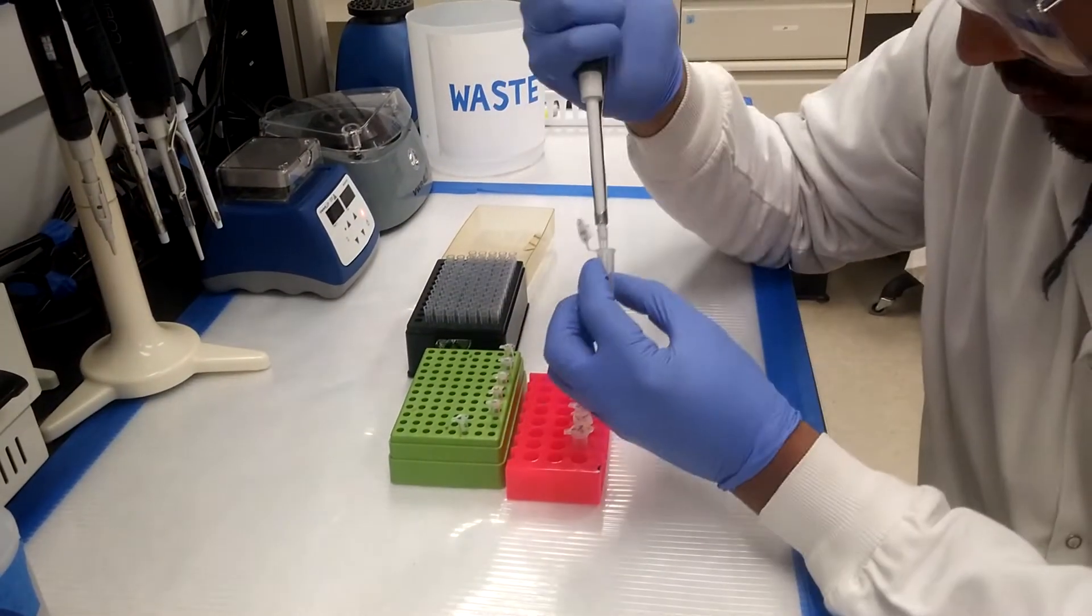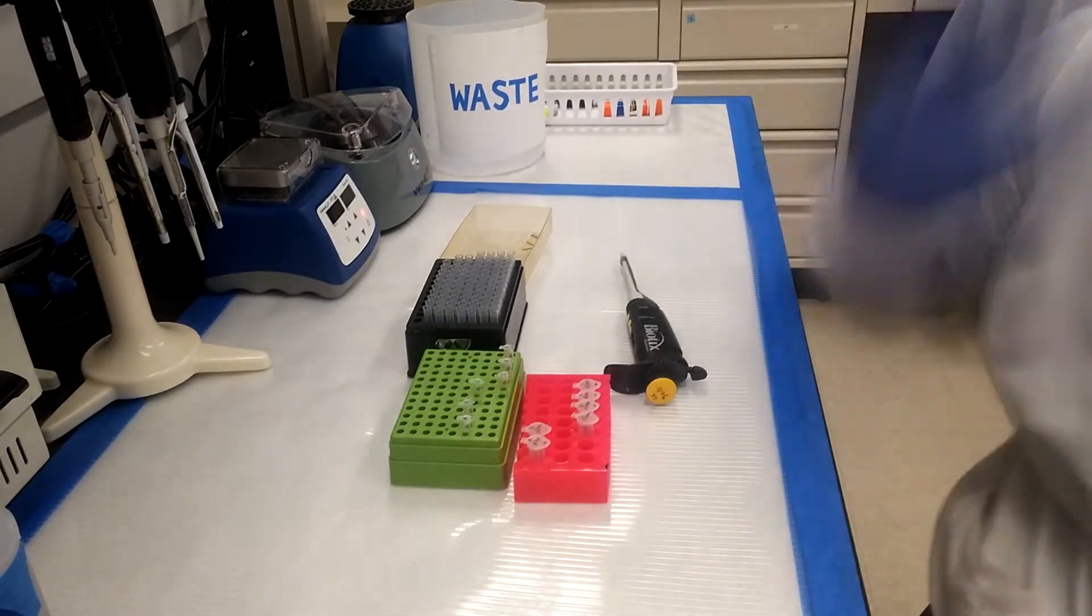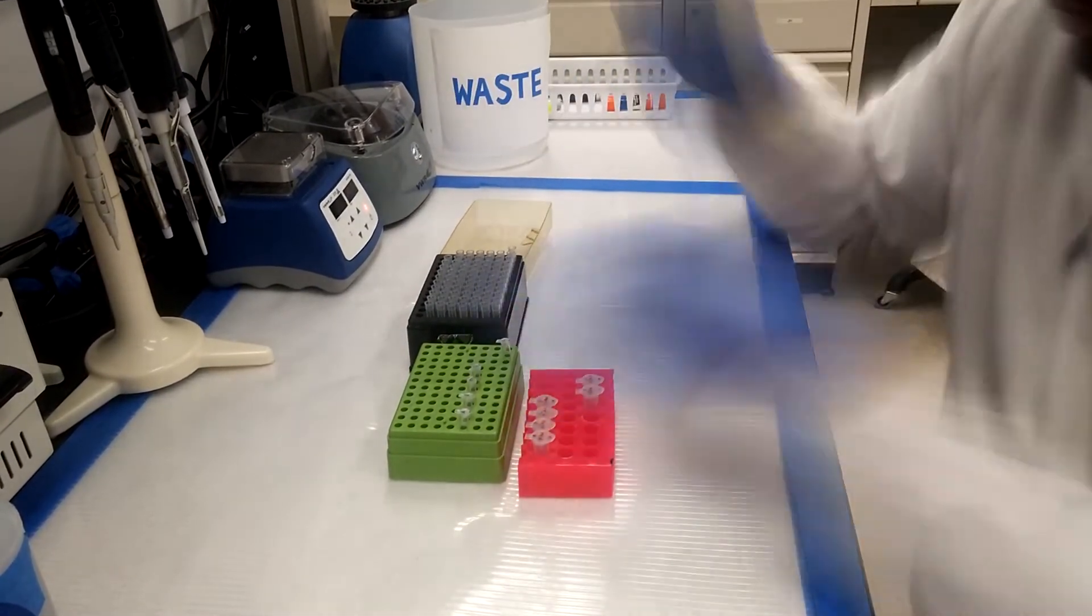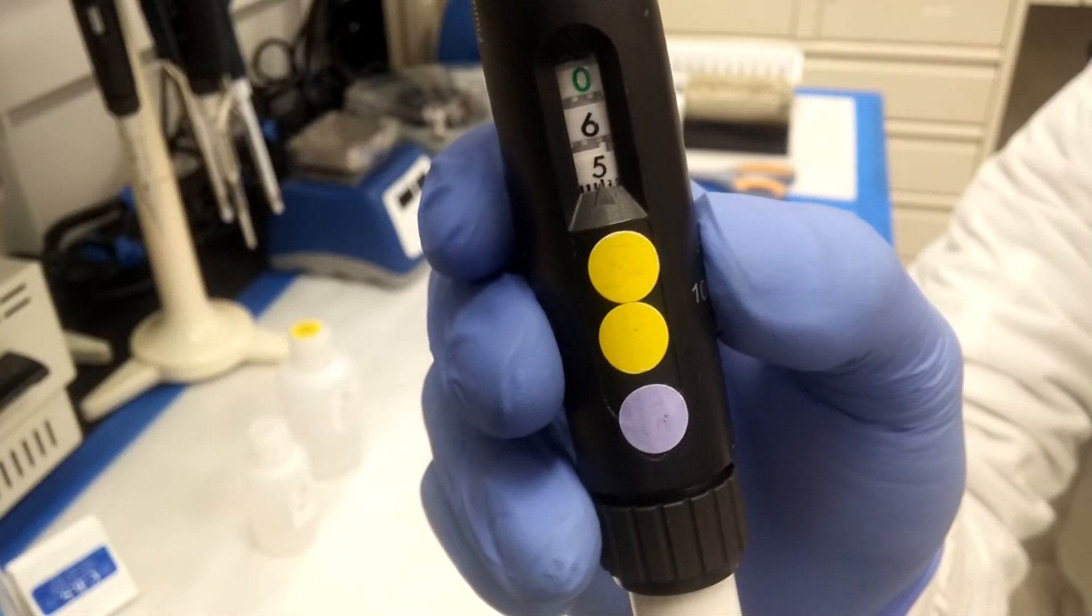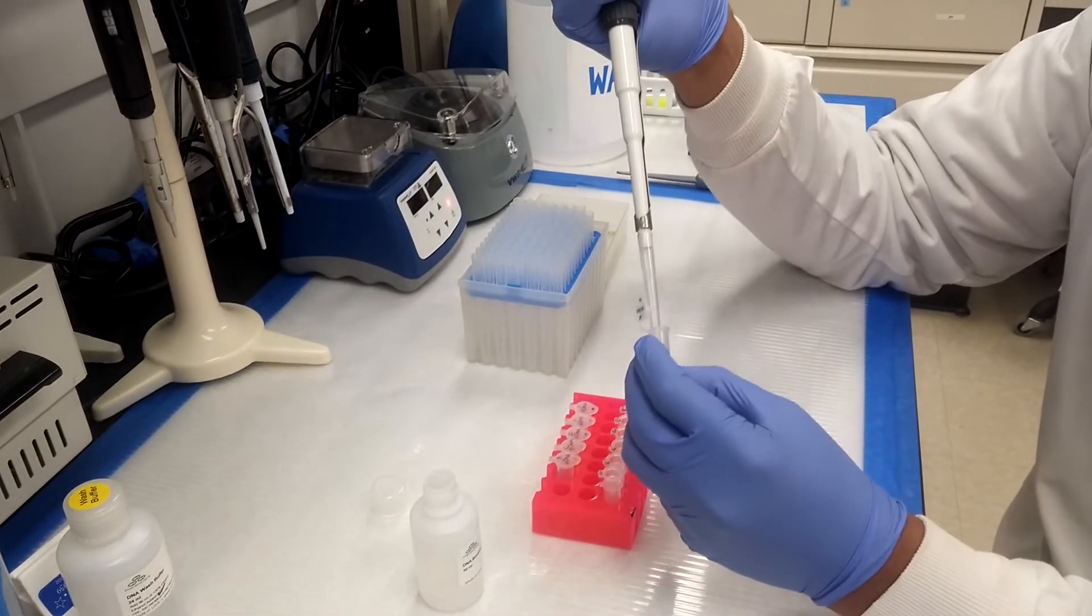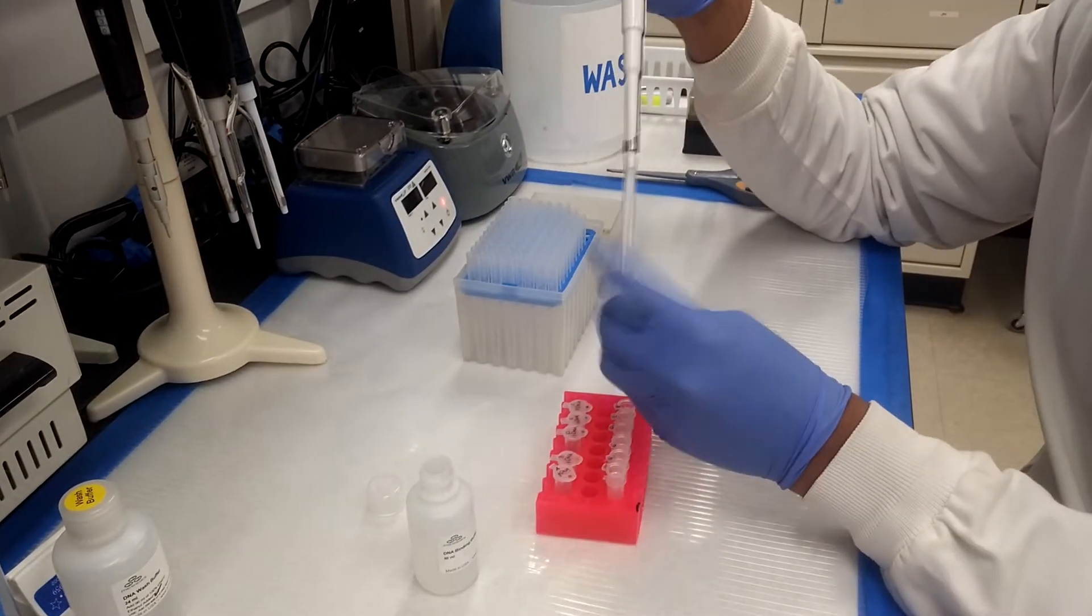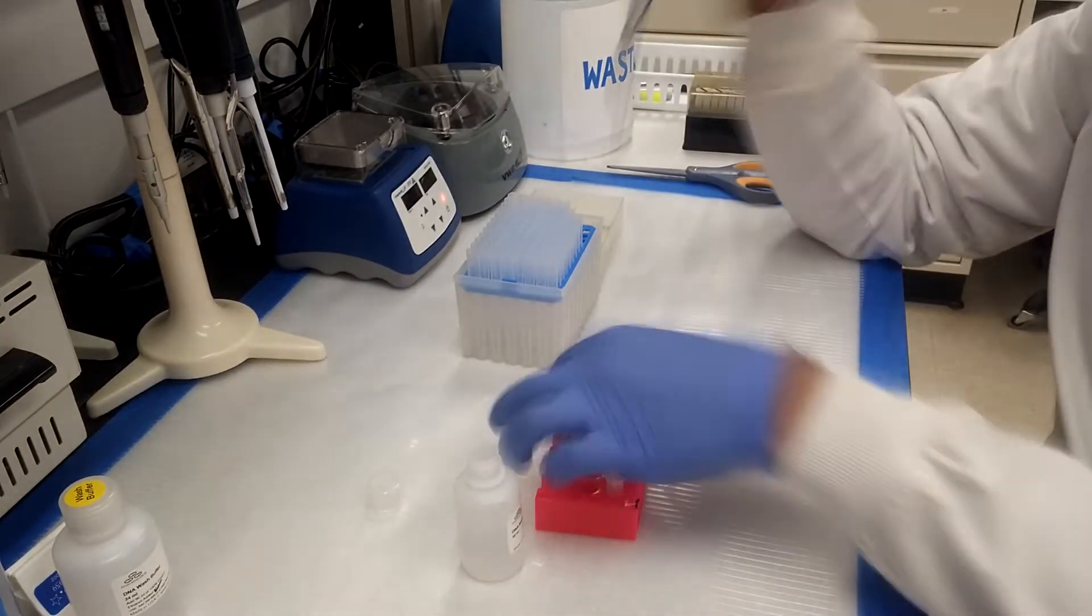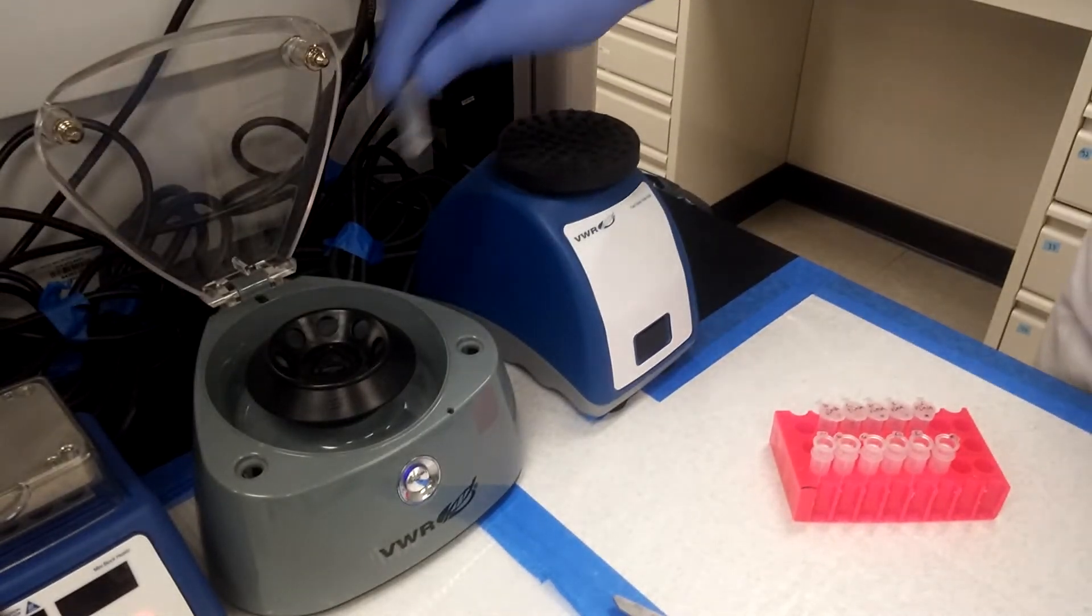The corresponding amplified DNA samples from the PCR procedure are moved into the first set. 650 microliters of DNA binding buffer are added to each tube. The tubes are then vortexed and centrifuged.